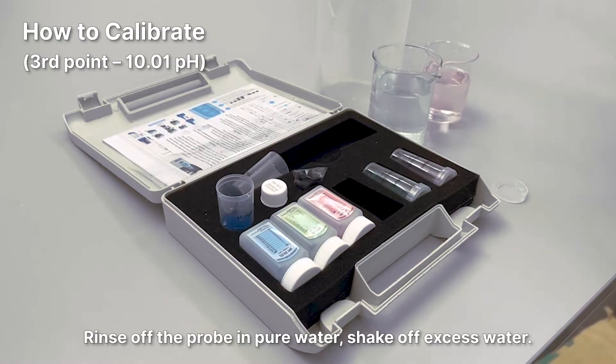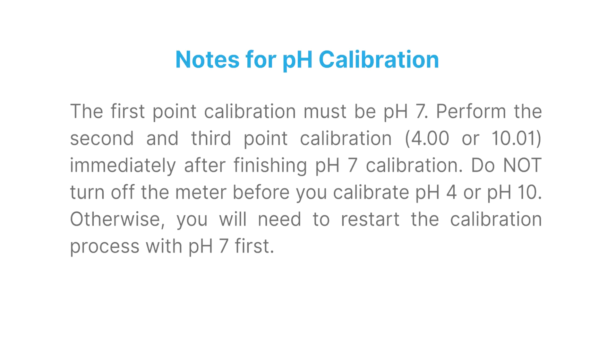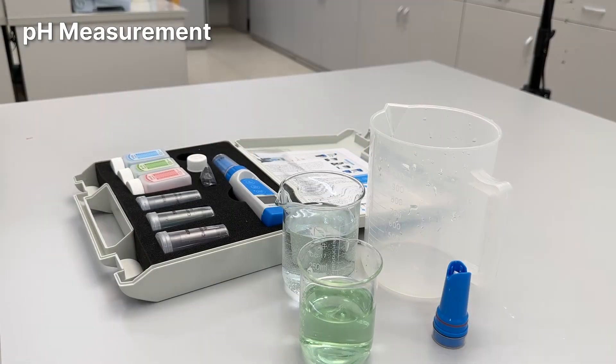Notes for pH calibration: the first point calibration must be pH 7. Perform the second and third point calibration immediately after finishing pH 7 calibration. Do not turn off the meter before you calibrate pH 4 or pH 10 — otherwise you will need to restart the calibration process with pH 7 first.